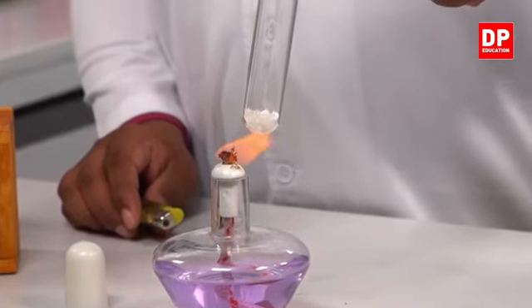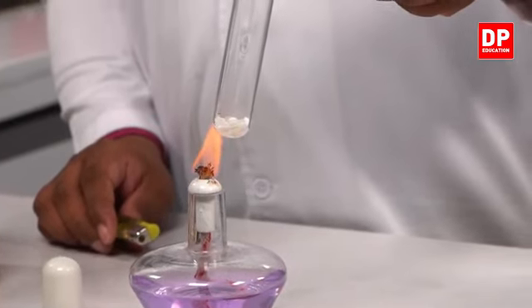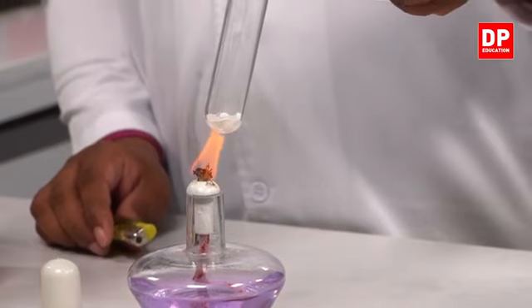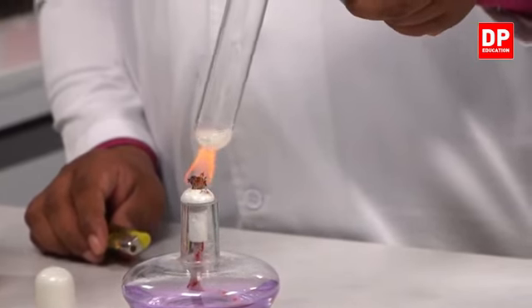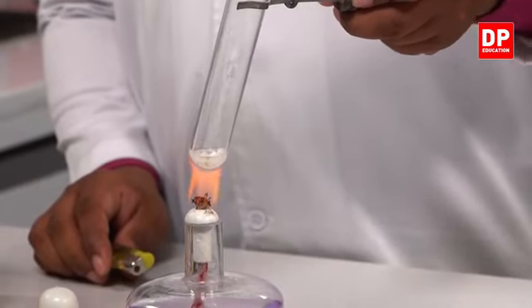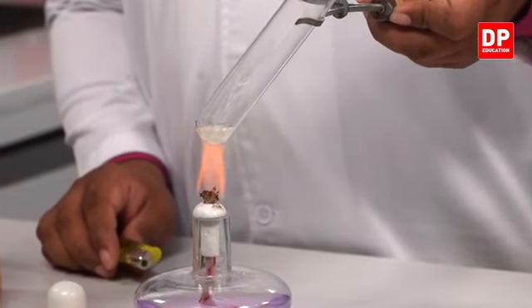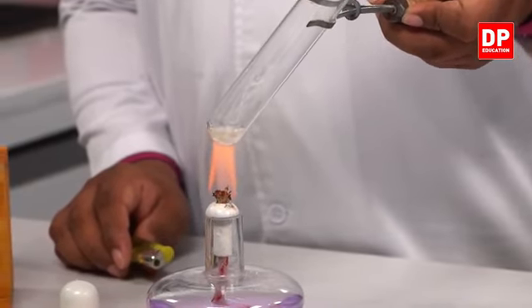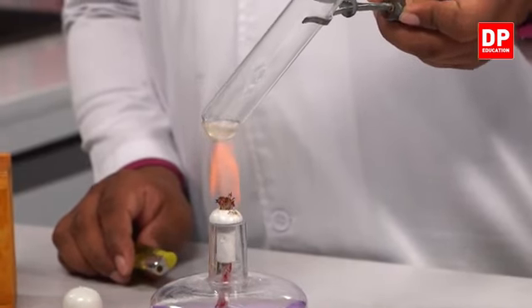You can see clearly the solid wax is turning into a liquid inside the boiling tube. See, children, you can see that it's clearly turning into a liquid.